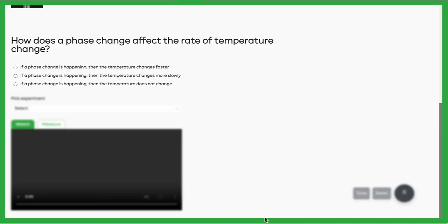Welcome to the Smart Science Measurement video about phase changes. In this lab, we're going to look at how the phase change of a substance affects the rate of the temperature change during that phase change. A phase change is the change in state, either from solid to liquid, liquid to gas.